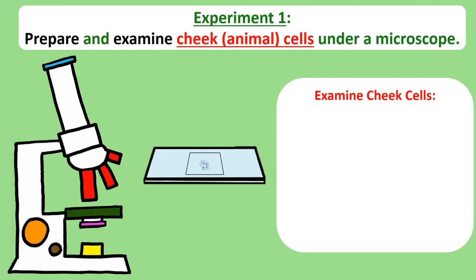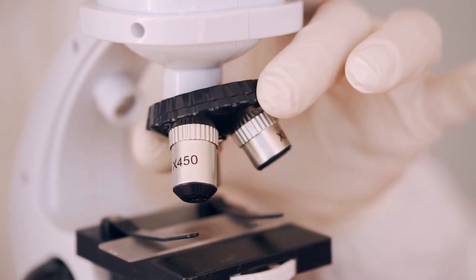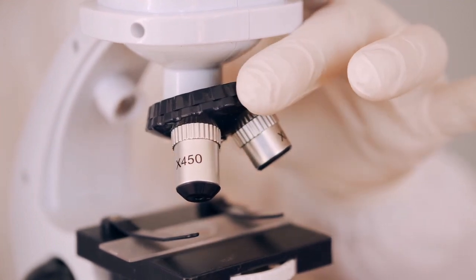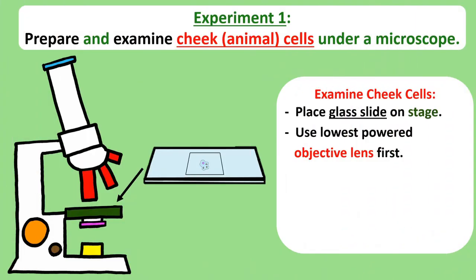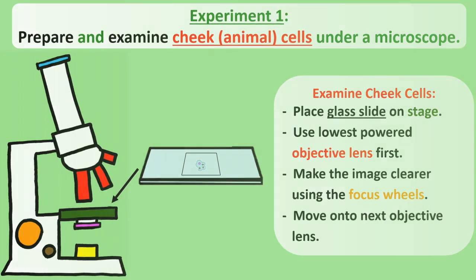And now for the fun part, examining the cells. Take the glass slide and gently place it onto the stage, securing it with those metal clips. Now remember previously we mentioned that there are three objective lenses, a low power, medium power and high powered one. Swivel to the lowest powered lens first and view the cells through the eyepiece lens. If the image is blurry, adjust the coarse focus wheel and then the fine focus wheel before moving on to the next highest powered lens.